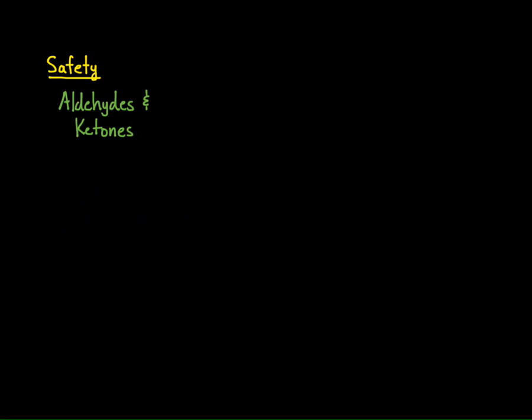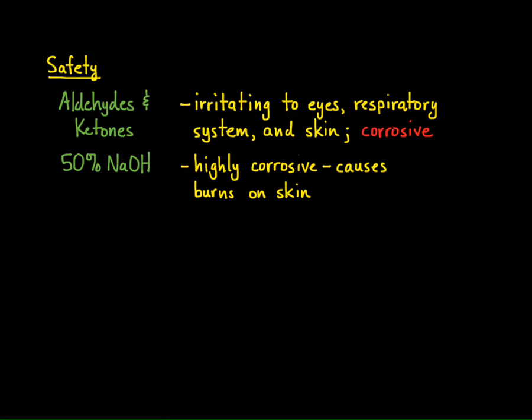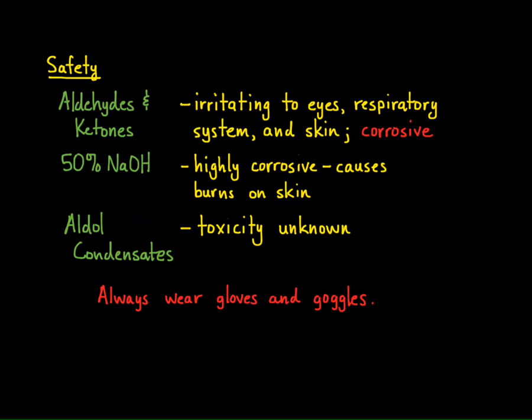For your safety, understand that the aldehydes and ketones are irritants and corrosive. The 50% sodium hydroxide solution you will be making up is highly corrosive and will cause burns to the skin. Most importantly, the aldol condensates have unknown toxicity. Because of this, you should wear gloves and goggles at all times.